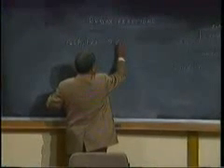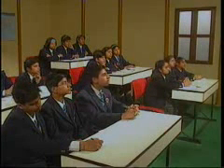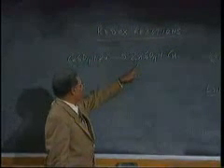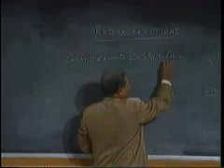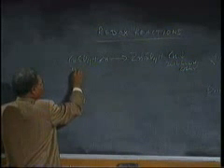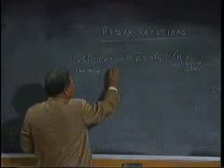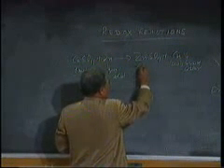And what change do we find in this case is zinc is forming zinc sulfate, and then we are getting the formation of copper. Copper sulfate has changed to zinc sulfate, and then copper has been separated out. This dark brown color, this one is blue solution, and this one is gray solid, and this one is colorless solution.